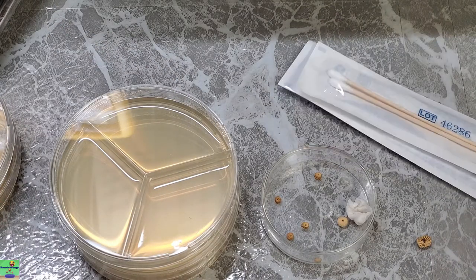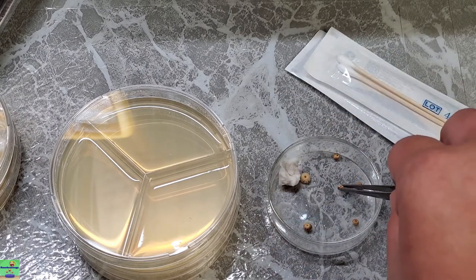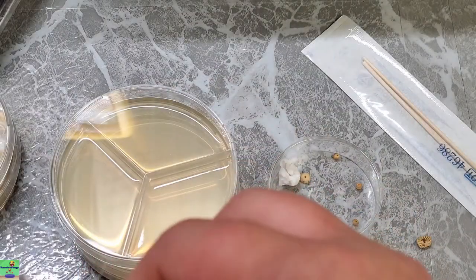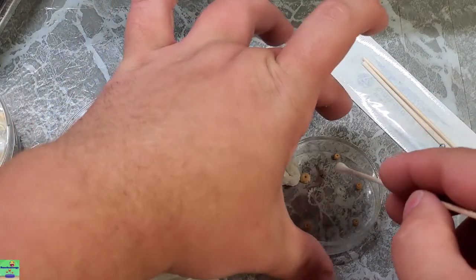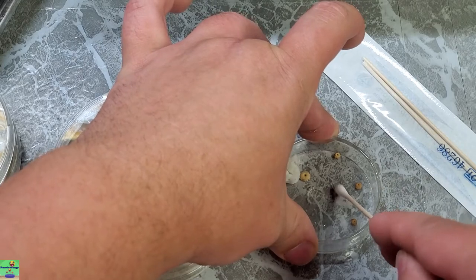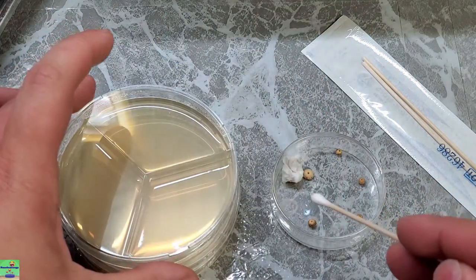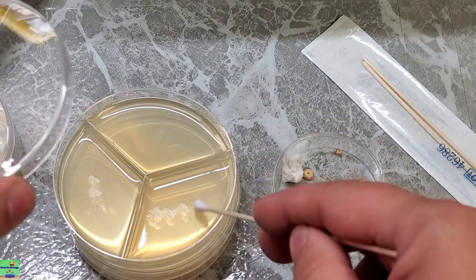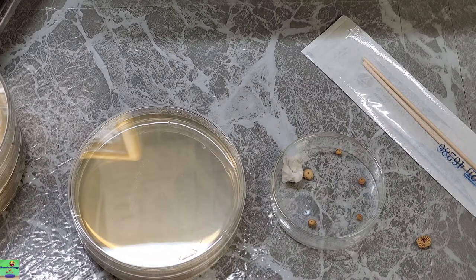Let's try taking some from this really little guy right there, because he's pretty cute. Nice. Get another cotton tip applicator. Probably have to hold this still. And just scrape some of these spores off. You don't have to get every single bit. And then just do some little swirls onto the surface of the agar.